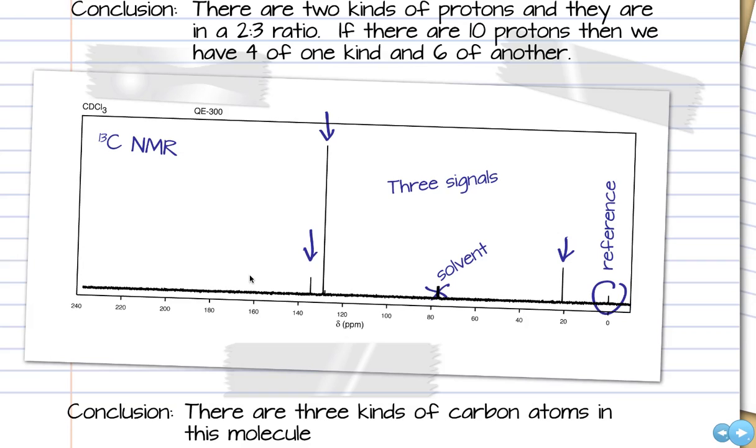The difference is an IR spectrometer costs $40,000 and a nuclear magnetic resonance spectrometer costs $500,000. So what's more likely to be on your bench? So IR is still very useful. People use IR all the time because it's available, it's easy, and you'll need a small amount of material. NMR, especially carbon-13 NMR, you need a lot more material. And of course, you have a much more expensive instrument, and probably you're paying a salary for the person who actually runs that instrument and keeps it alive.